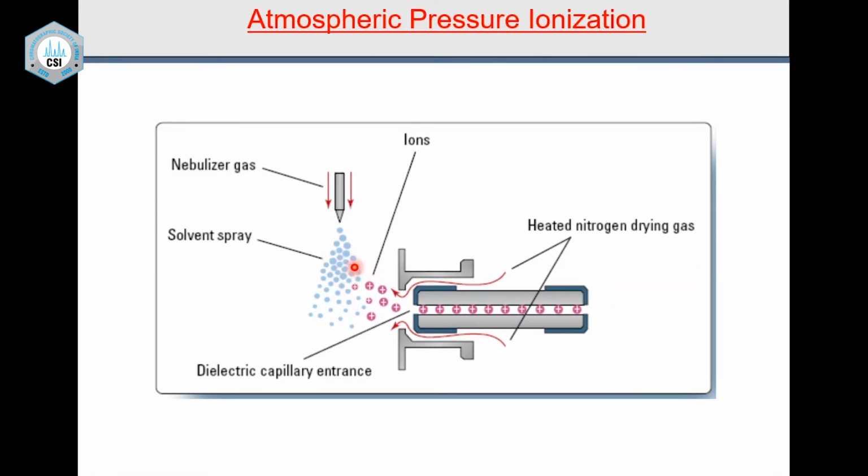That is inside this. Now the idea is you have to dry these droplets and make sure the ions are liberated, and ions are sucked into the mass spectrometer. So if it is a positive ion, then we create a negative ion voltage here, a negative potential, so the ions are sucked into the mass spectrometer. It is a sucking, whereas the neutrals and the solvents do not get sucked in. So you apply a negative voltage in such a way that all the positive ions get sucked into the mass spectrometer. This is the beautiful way that this is done.